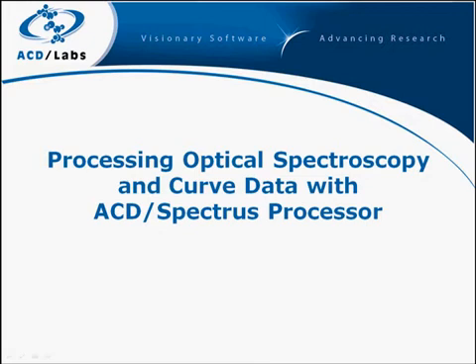In this tutorial, we will look at processing optical and curved data in the Spectrus Processor environment. We will start with basic processing functions.